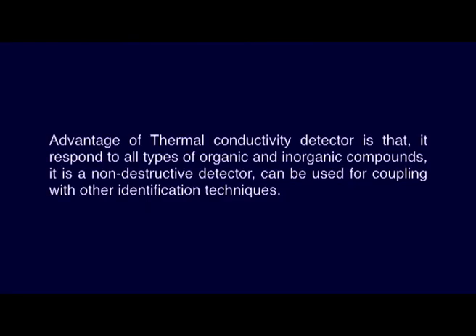The advantage of the TCD detector is that it responds to all types of organic and inorganic compounds. It is a non-destructive detector. So, whatever effluent, carrier gas, or sample component comes out of the TCD detector, we can pass into another detector, and identify it by coupling with other identification techniques. The detector is simple and inexpensive, however it is less sensitive, and biological samples cannot be analyzed using TCD detectors.